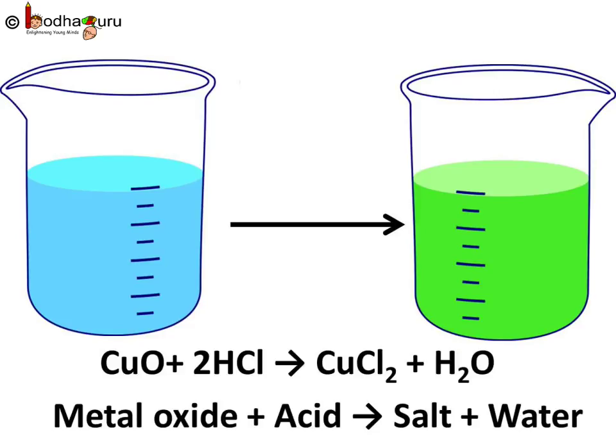What if we add acid to a metal oxide? We take a small amount of copper oxide in a beaker and add dilute hydrochloric acid slowly while stirring. We see the colour of the solution turns blue-green, and this is because of the formation of copper chloride. So an acid produces salt and water in reaction with a metal oxide.